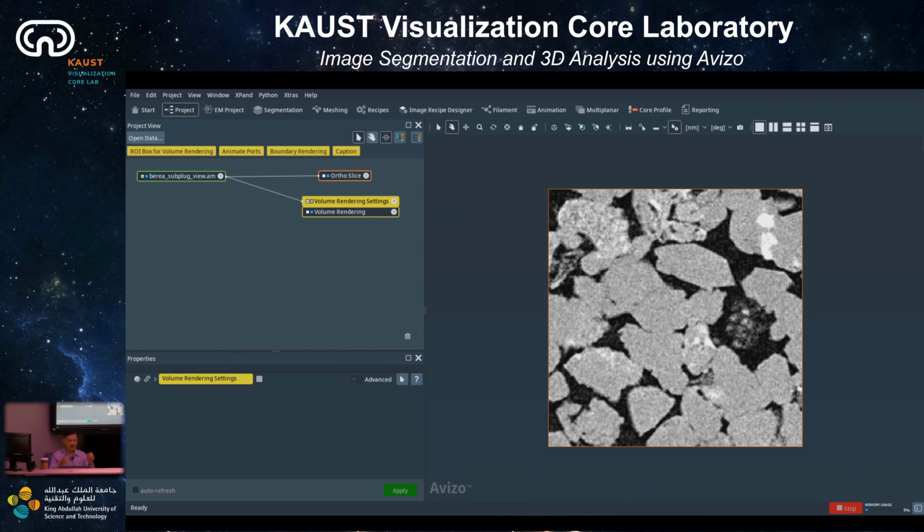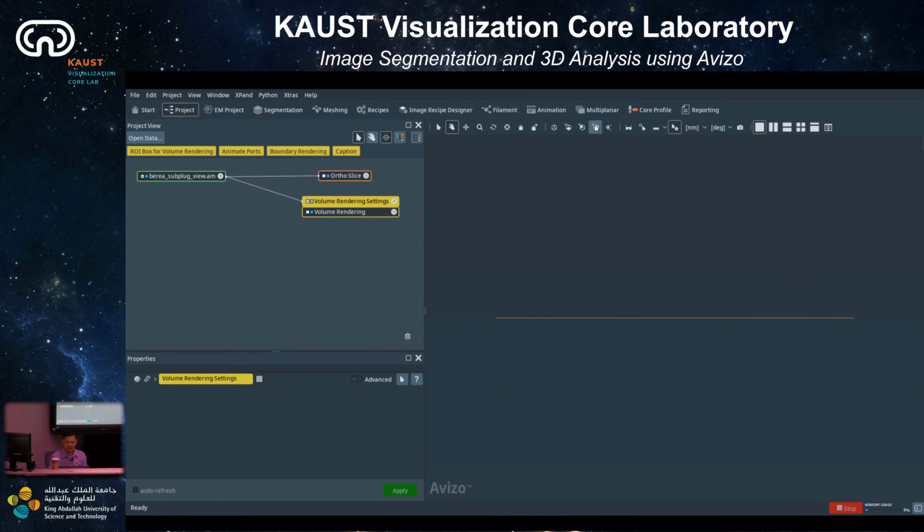What moves is how we project your camera onto the object. For example, you have the object like this, and you look at the sides, the front, the top. This is how you hold your camera. So this is a tool that acts as if you point your camera to this image.